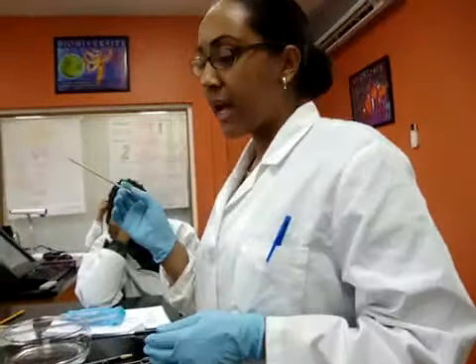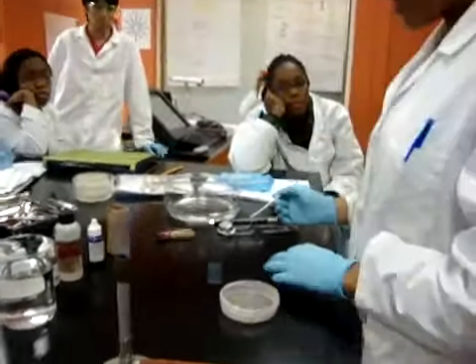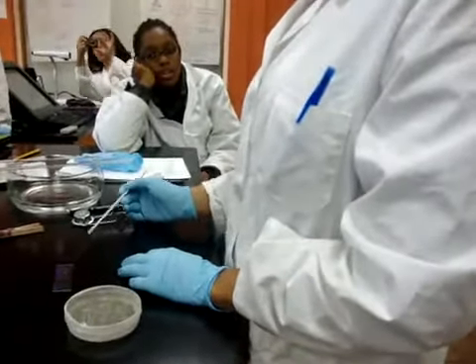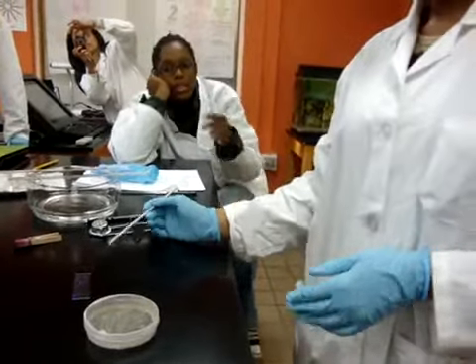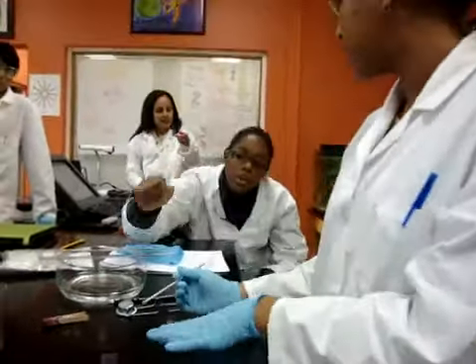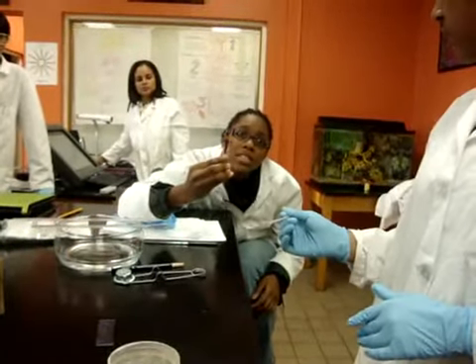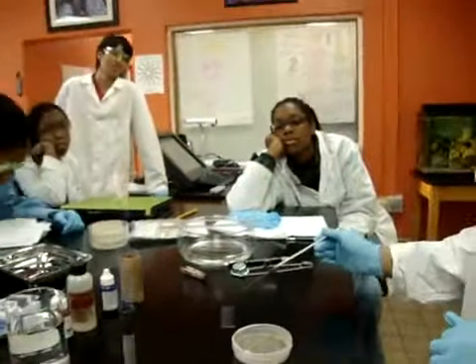So I'm going to take my sterile loop and dip it in my distilled water just to get a loop full of water and place that on my slide. So we don't sterilize the slide? You washed it with soap and water first. I said I'm going to pretend that this is sterile. I know it's not. Okay, so I put my water on my slide.